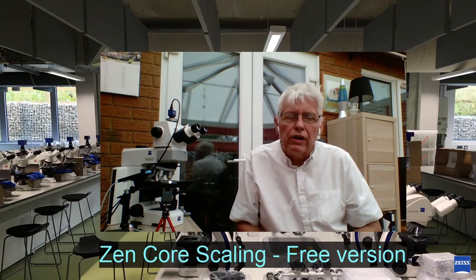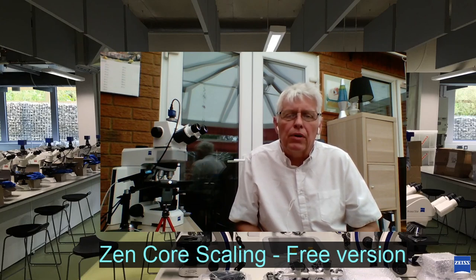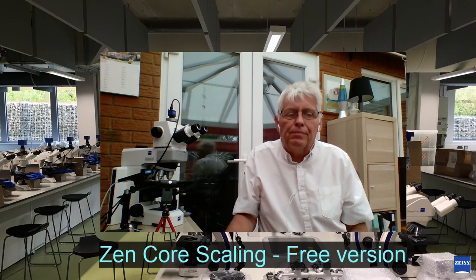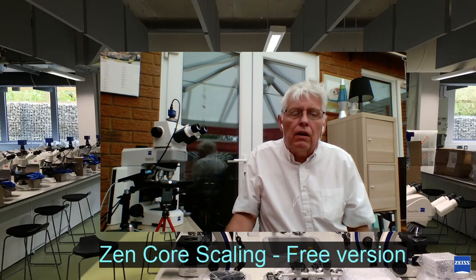So it's the Zeiss Zencore program and how to calibrate your microscope. There are a lot of questions about calibrations and scalings. What we're really doing is telling the software how big the picture is. We need to look at the individual pixels that make up the image and assign them a width. Once we've done that, we're able to calculate how big things are and make measurements.